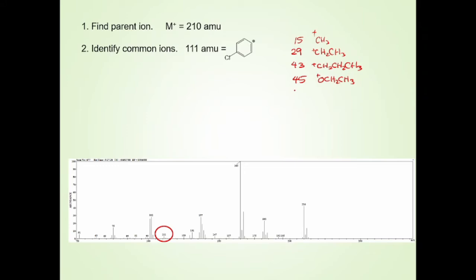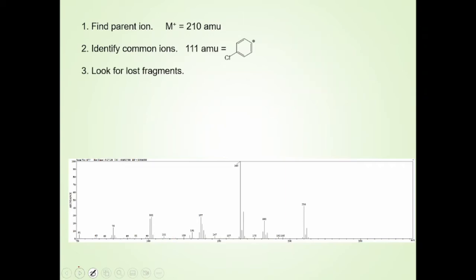And one other that should be fairly familiar, 77. Remember that one? Does that ring bells for anyone? Back beginning of the semester. 77 is the mass of the phenyl cation. So the C6H5. So 77 would be that one. This one doesn't have any of those common ones, so I just picked a chlorophenyl, which again is not common unless you're dealing in that area.